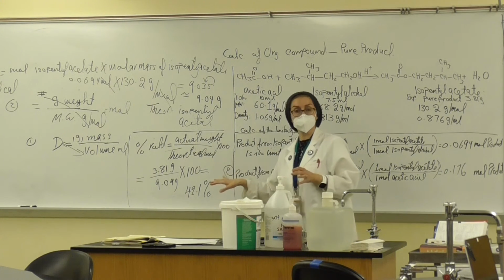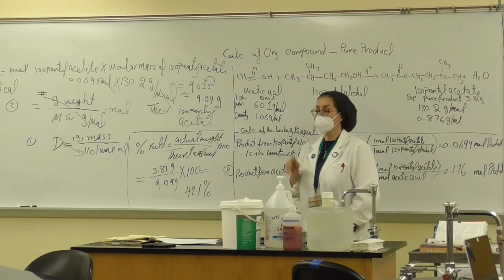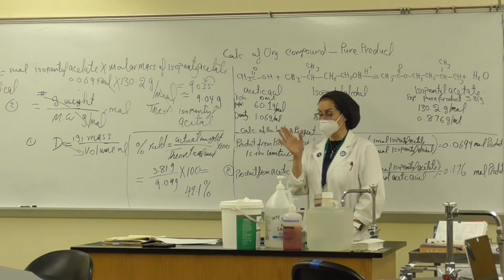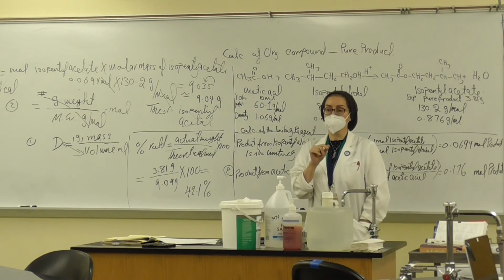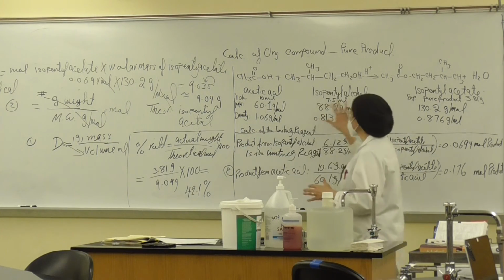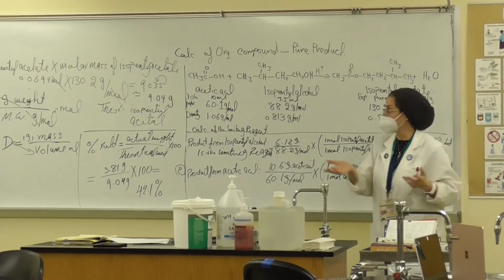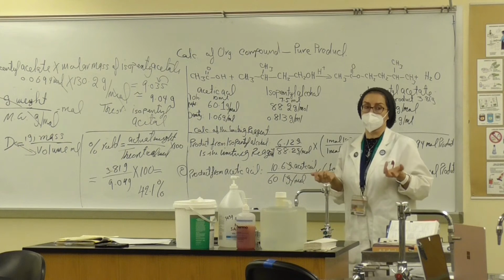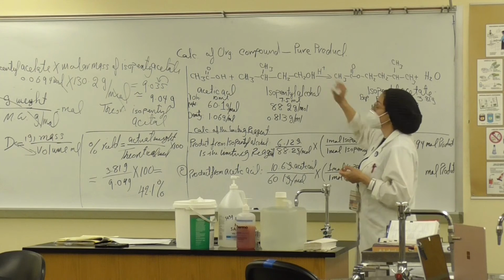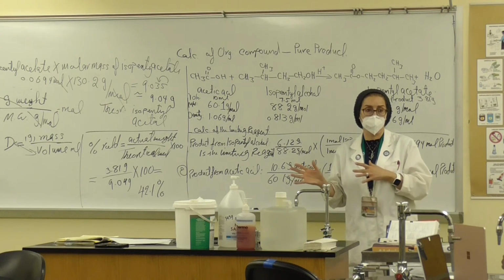Now, in the industry, this reaction is not going to be good. At least in the industry, we should have 50 and higher percentage of your pure product to be able to utilize and implement such a procedure. Because this reaction is probably going to be used in another way, using different acids. Maybe they are not going to have acetic acid. Maybe they're going to have acetic anhydride. Maybe they are going to use a different, stronger acid, hydrochloric or sulfuric, instead of the acid that they use.